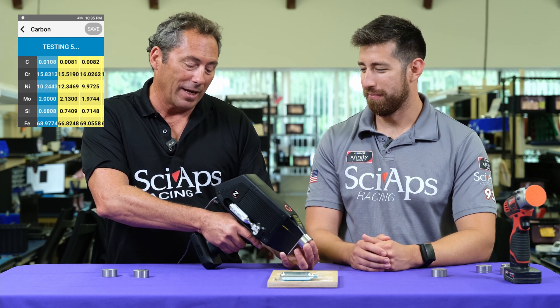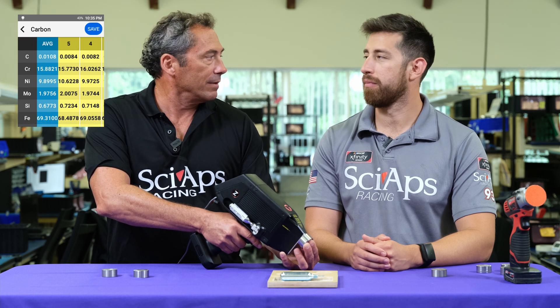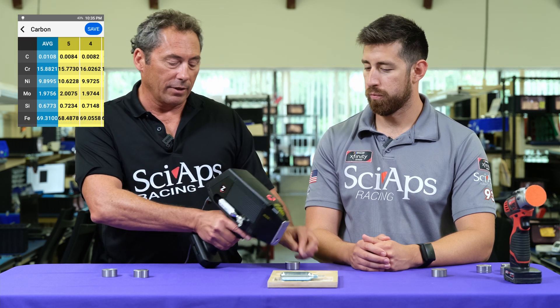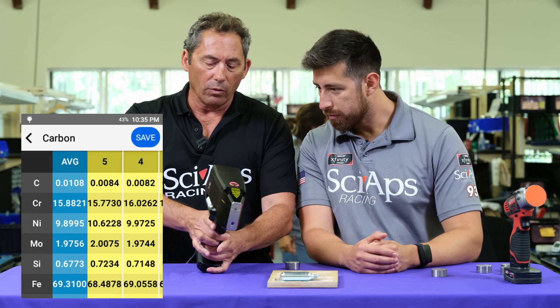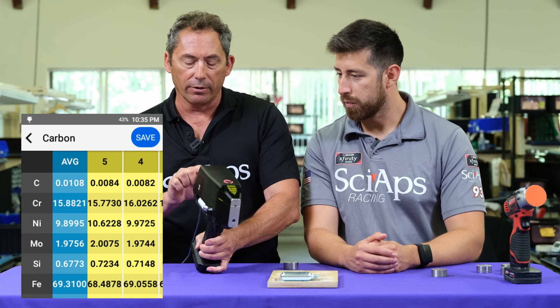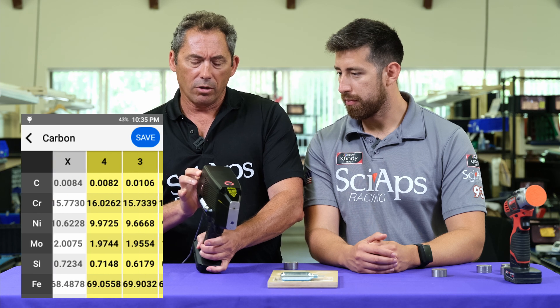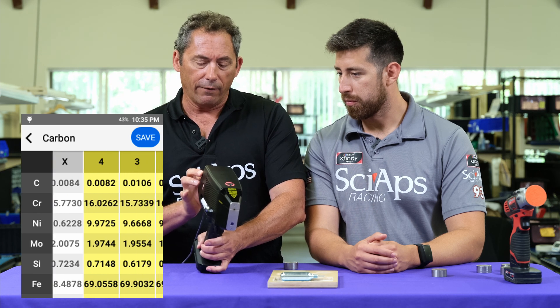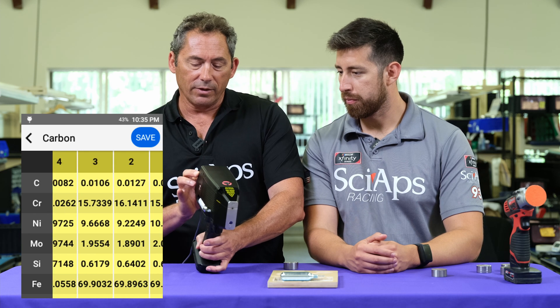We're almost done here — we set it up to do five repeat tests, though most of our users do a pre-burn and two or three tests. If you look at the numbers now, the average is 0.011 and this is a 0.012 standard, so that's a very good average. Really good repeatability: 0.0084, 0.0082, 0.010, 0.010 again — these are all within 20 PPM.